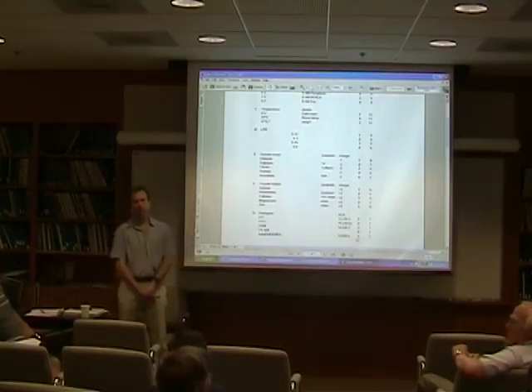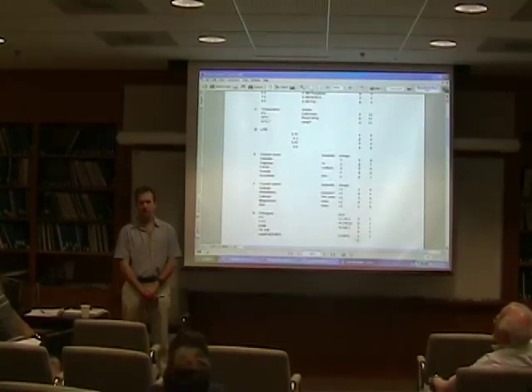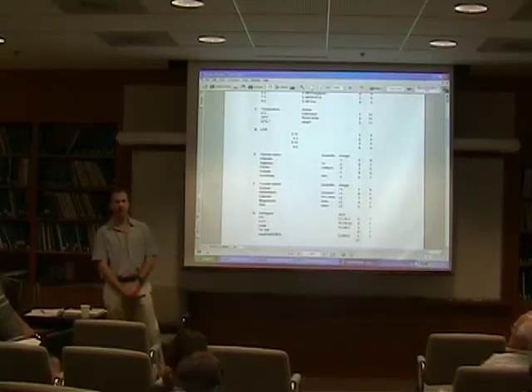If you're using sphingomyelin and cholesterol, isn't the formation of gel phase domains a consideration if you're working at 4 degrees or 20 degrees? So those aren't necessarily independent, unless that doesn't inhibit crystal growth. So what you're saying is if you put cholesterol in at say 4 degrees, you might get cholesterol, sphingomyelin, and POPC, then you're likely going to get raft domains. Yeah. So if you want to inhibit that, you wouldn't do it at a lower temperature. So that wouldn't necessarily be random either.